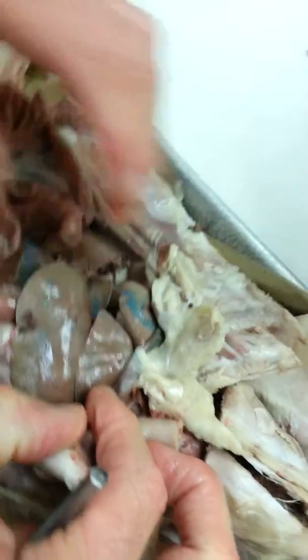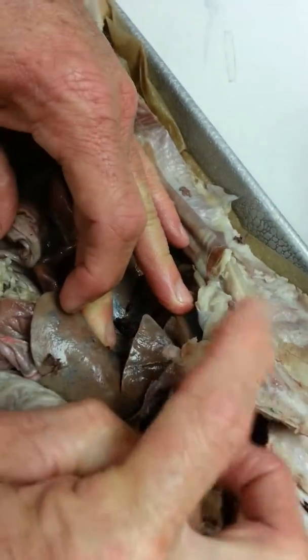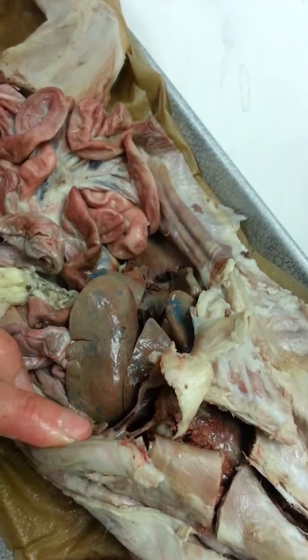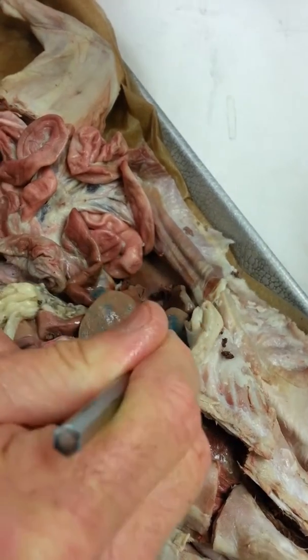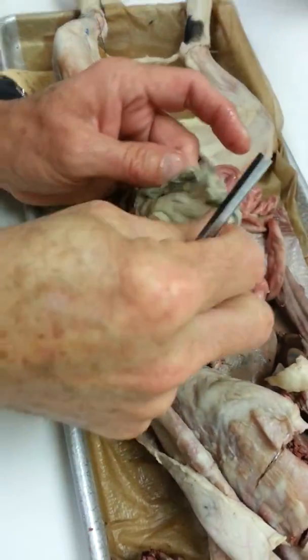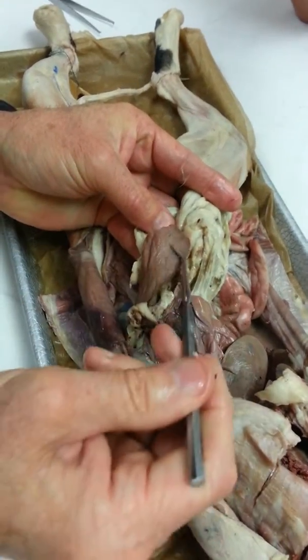On the left side, you have a smaller left medial. This is left medial right here. And this is left lateral right here. So there's 4 lobes you have to know. Left lateral and left medial. Then this big one's right medial, and then right lateral is deep. All this material here, greater omentum. This is the spleen over here.